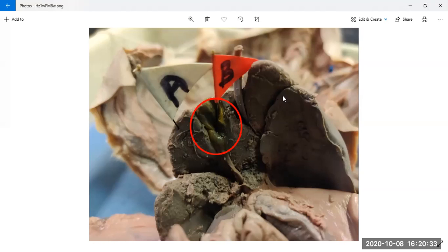Liver produces it, and gallbladder stores it, and then from gallbladder the bile goes straight to the duodenum, which is the first part of the small intestine. Okay, so liver, like different lobes, 1, 2, 3, 4, we have 4 different lobes, and underneath one of the lobes, I think the right lobe, if I'm not mistaken, is the gallbladder.